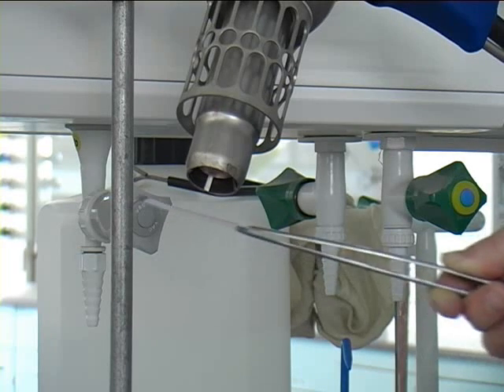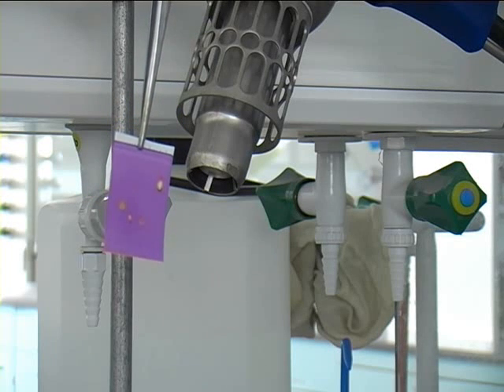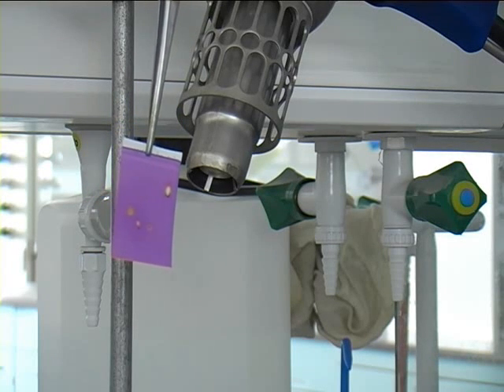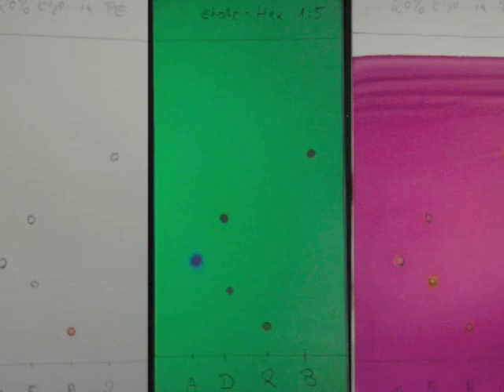After you're finished, you can see the TLC plate, as shown here. Different spots have shown up in different colors and after different amount of time. All that remains is to depict your TLC plate in the laboratory notebook and to calculate your RF values. Also remember to note down how you visualized your spots.